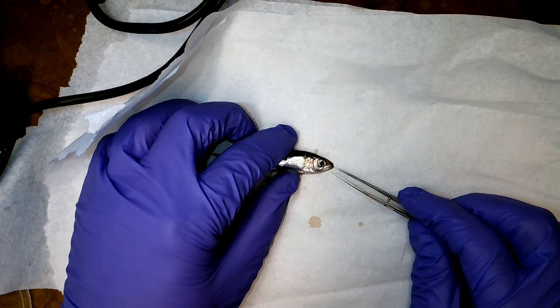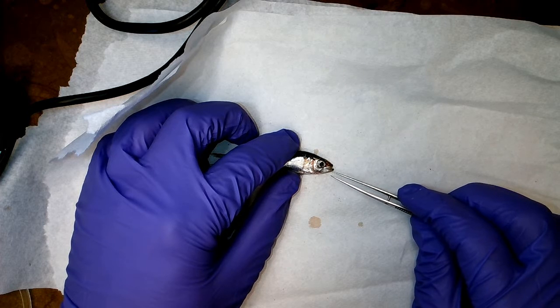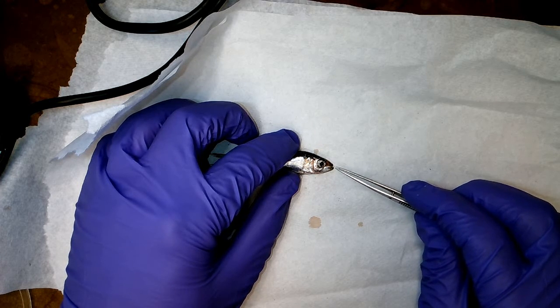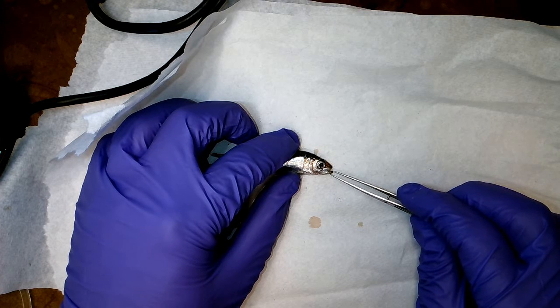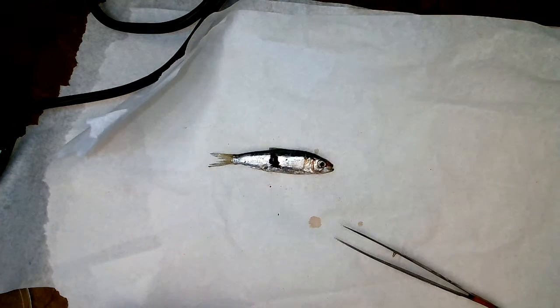On 2A, hickory shad, you can look up some pictures of this. This lower jaw is going to come way up out here. It's going to hook up, be pretty noticeable. This is relatively even, as you can see. So this is not a projecting jaw, and therefore I'm going to say 2B and move on to 3.